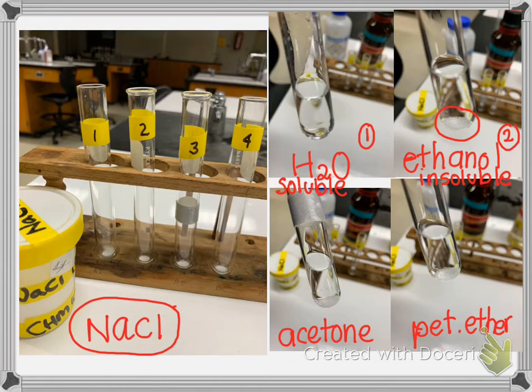And then this is number 3. And again, I'll show you where you're looking. Right down here, do you see that solid? So I tried to get it dissolved, and it wouldn't. So we say that that is insoluble. So when the solute does not dissolve in the solvent, it's called insoluble. And then petroleum ether, again, I see solid there, and it's called insoluble.